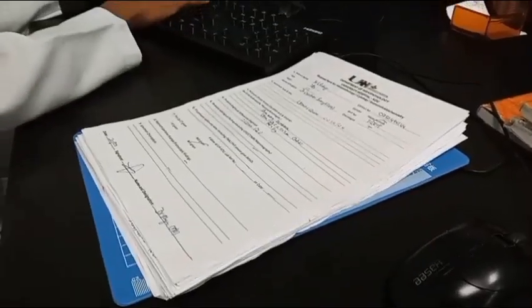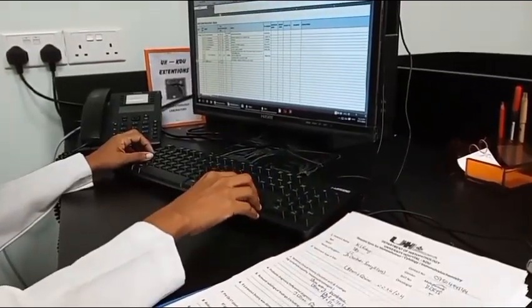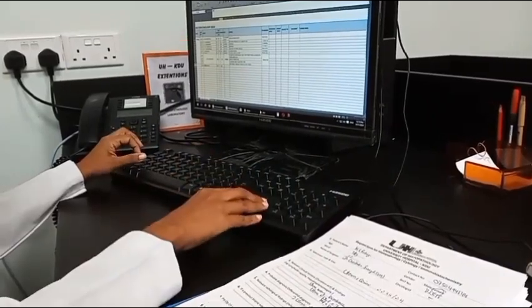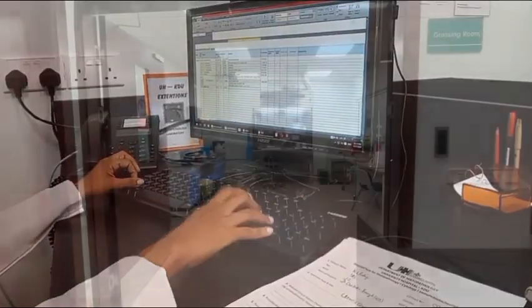The specimen should be immersed in a fixative. Commonly used fixatives for histology are 10% neutral buffered formalin or 10% formal saline. For cytology, 95% ethyl alcohol is used.